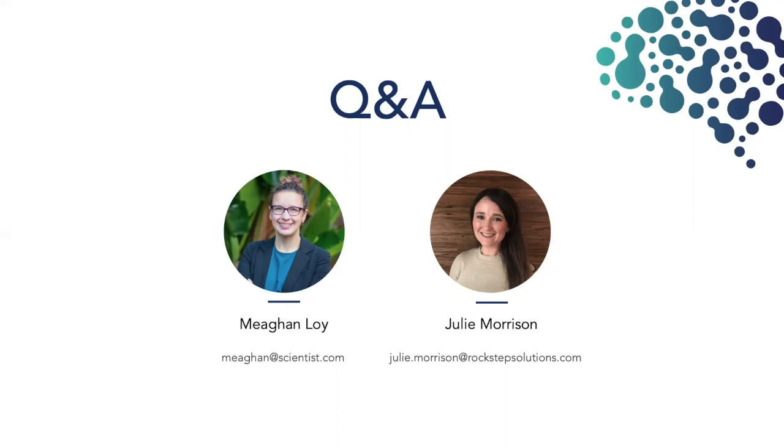Now, the caveat I would say to that is if you're piloting a software, you do want to take a couple of people that have the right mindset, that are really interested in working on this and making sure that this change goes forward, to become your primary stakeholders, what we'd call super users, that are going to help drive this throughout and become your go-to person in-house.